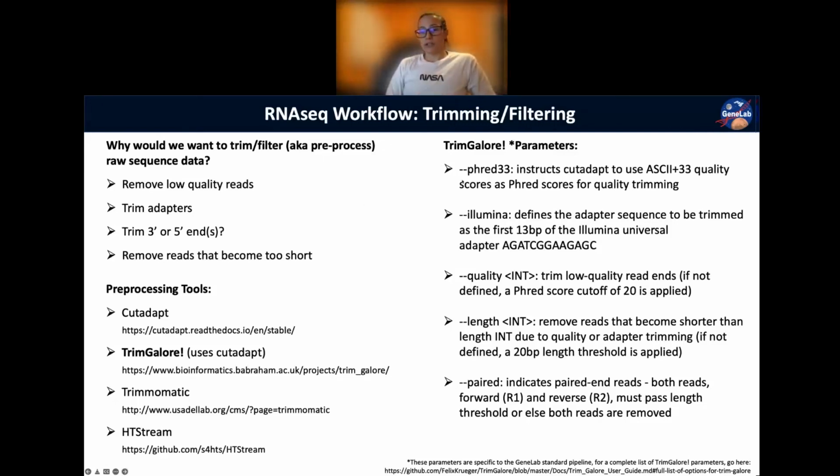Trim Galore, just like all the tools that we used when we did our intro to Unix and intro to R, comes with different options that you can set. All of these tools have a set of default options. If you don't know too much about the tool that you're using, I would recommend that you read the documentation for that tool to understand what it does and the different options available.